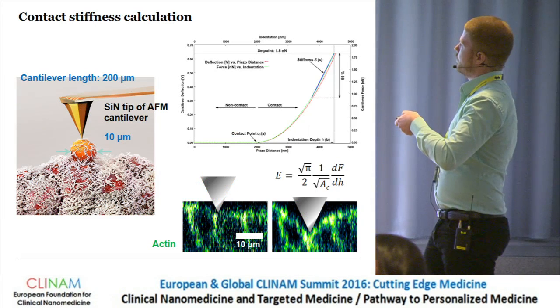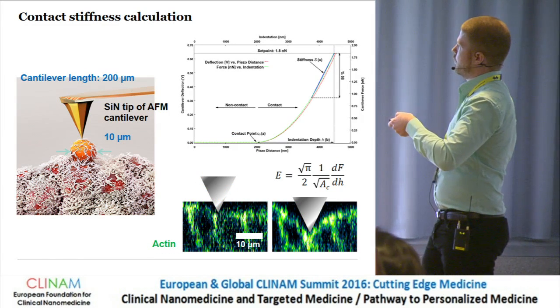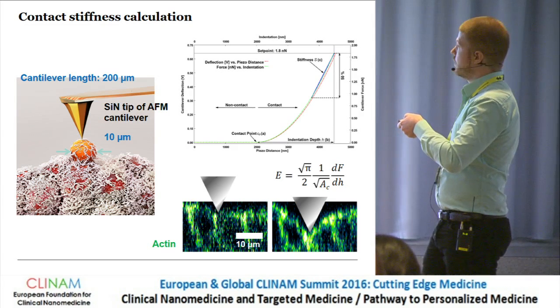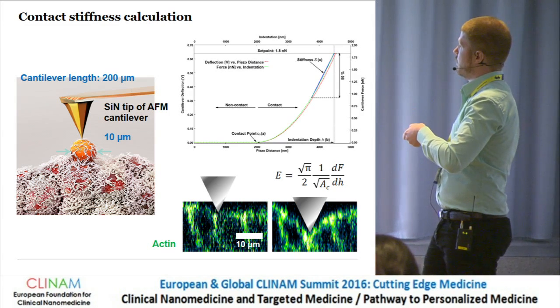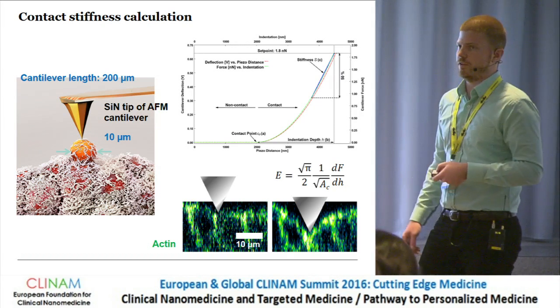In detail, you do this, then you analyze this by recording a force curve on these cells, and from the slope of this curve, and here the contact area between the lever and the cells, you can calculate your E modulus.